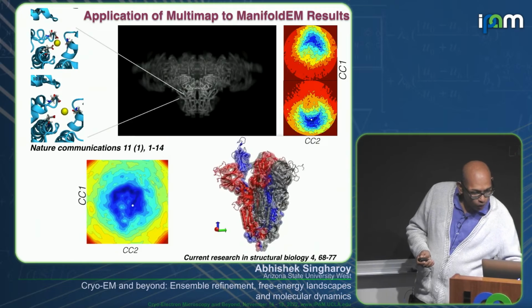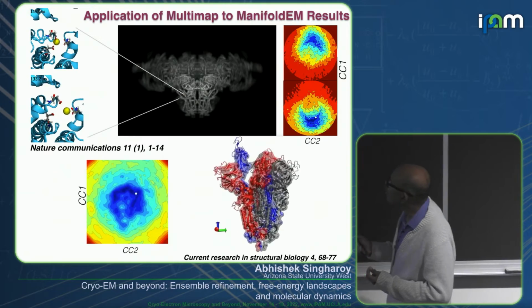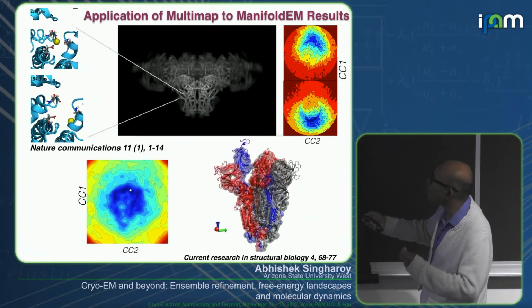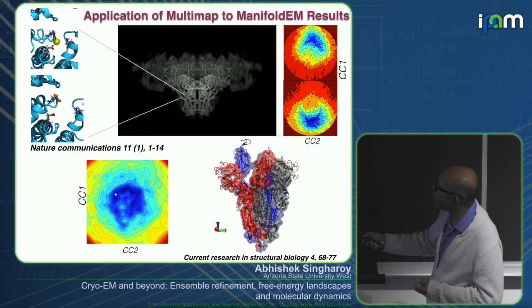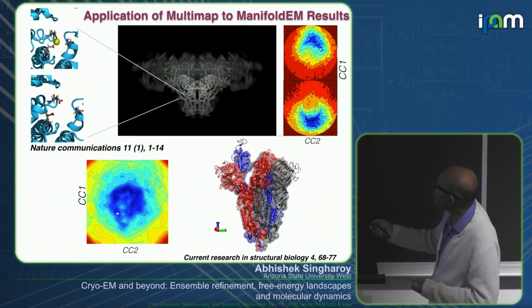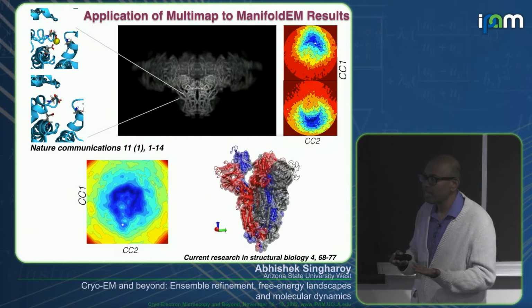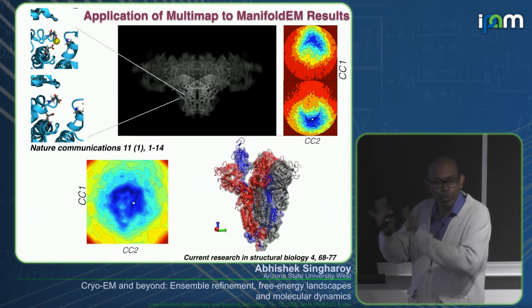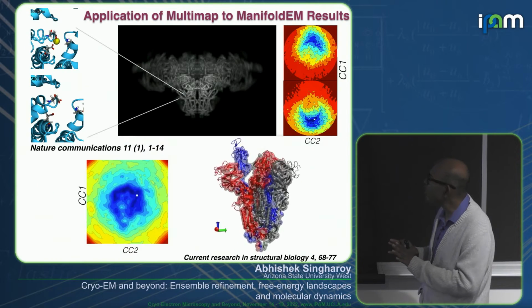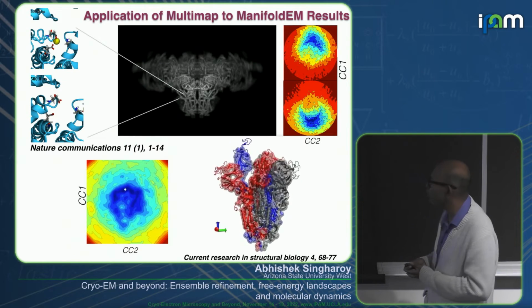The first thing is, often this gives a molecular dynamics simulator an opportunity to ask the question, what are these big systems doing? Like this big RyR movement. Then you look very locally into these regions and do very long molecular dynamics, and you see that when this thing is locked with the ions present, one conformation is more stable. When this ion is gone, another conformation is more stable. So at one level, it generates hypotheses. I can't disregard that. At the level of scientific discovery, it gives me a starting point that I would not have gotten otherwise, just starting from one structure.